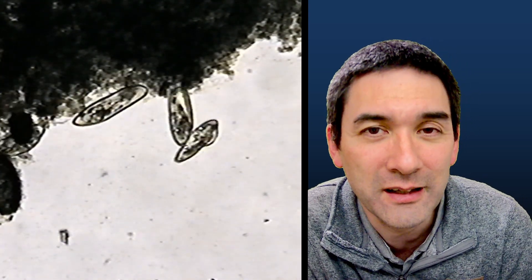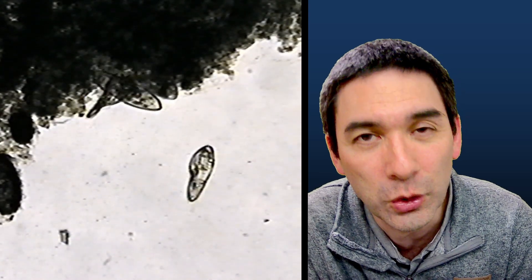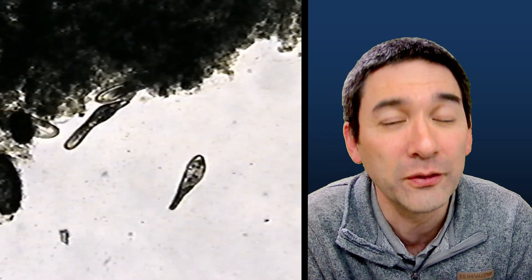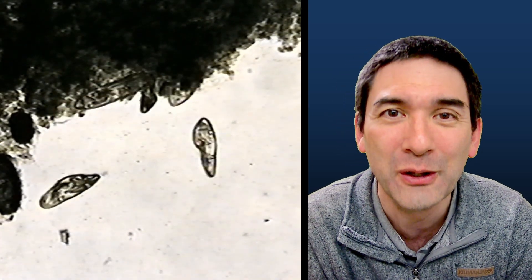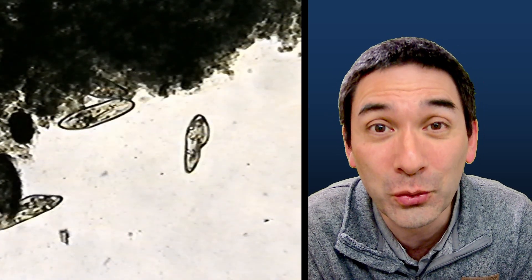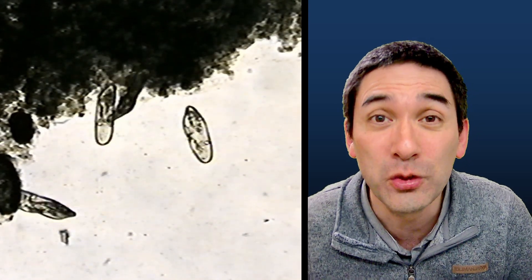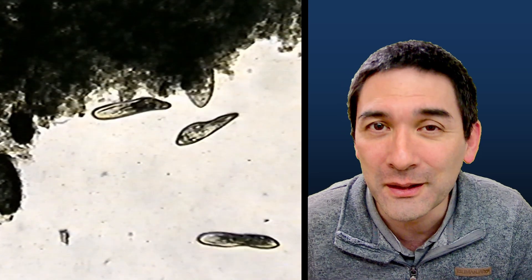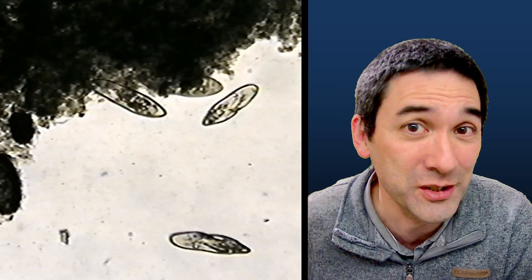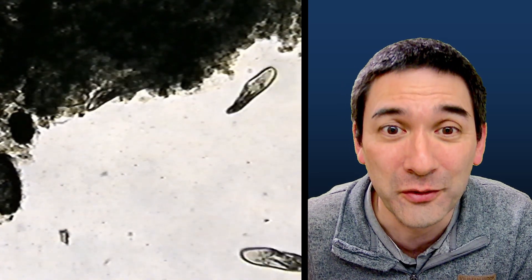This is quite a nice little experiment to demonstrate the effect of salt water and the effect of osmosis on cells. That's actually one of the reasons why you're not supposed to drink salt water, because the same thing would happen to our own body cells. The salt would accumulate in the blood and then there is an osmotic imbalance, and the blood cells are going to lose water just like those paramecia over here.